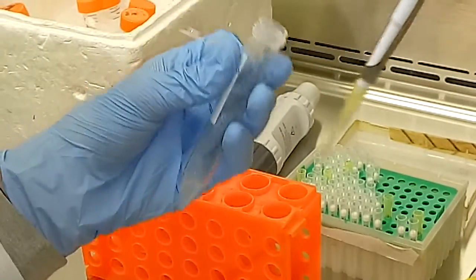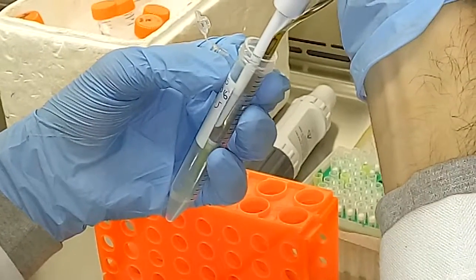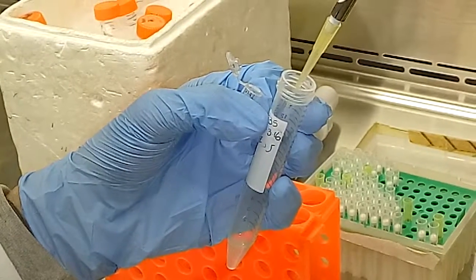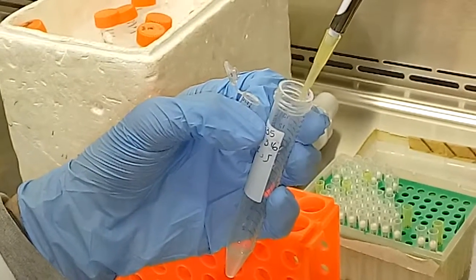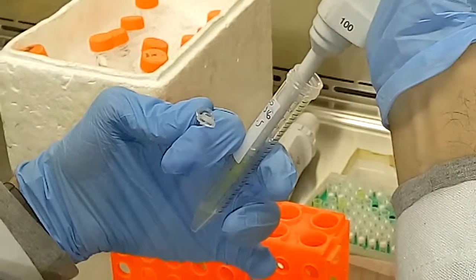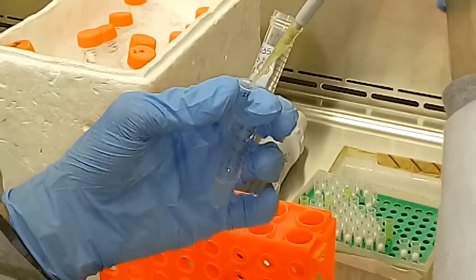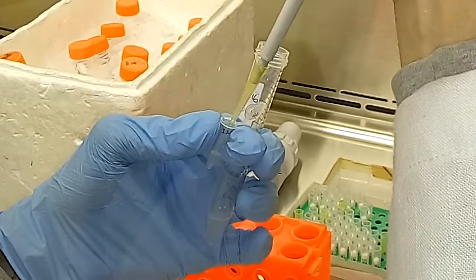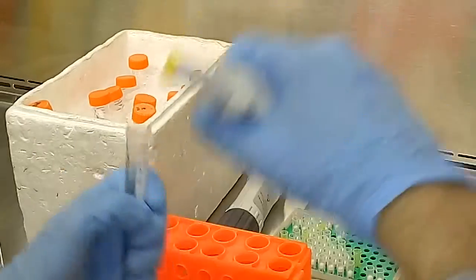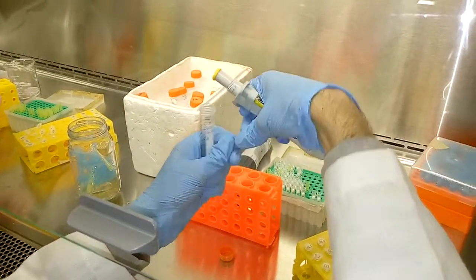Some of the most important elements in its genotype are lacZ delta M15, an element required for beta-galactosidase complementation when plated on X-gal. The gyrA96, which is a DNA gyrase mutant that produces resistance to nalidixic acid. The genotypes mcrA, mcrBC, and mrr, which are mutations that allow methylated DNA to not be recognized as foreign.